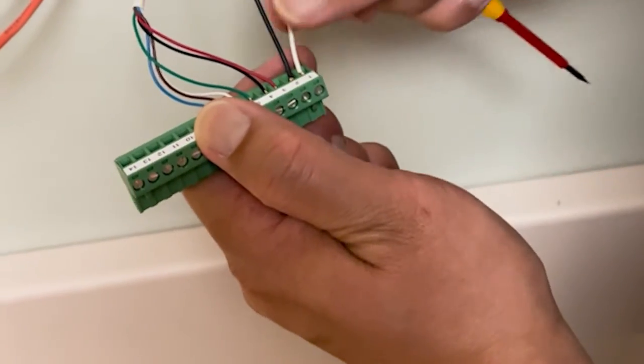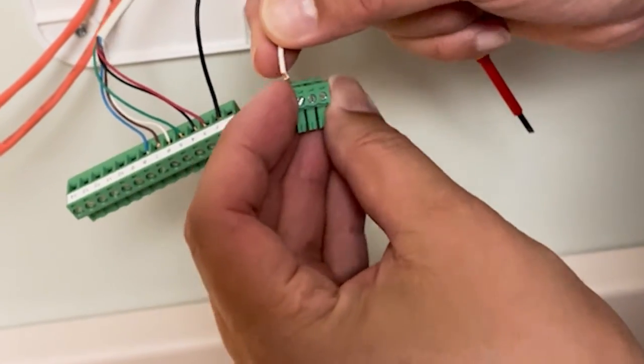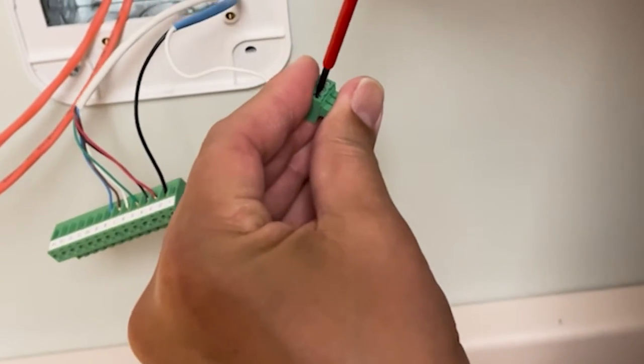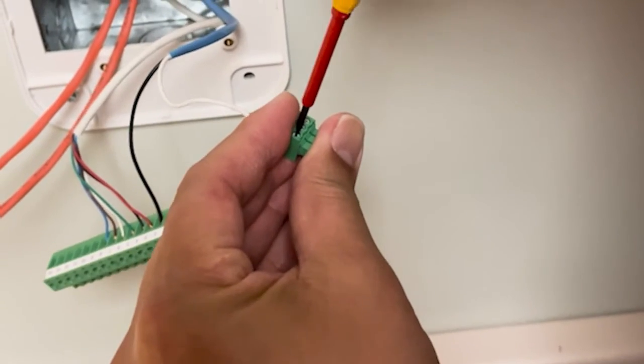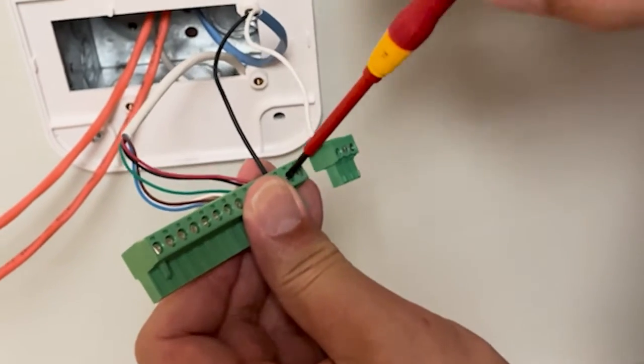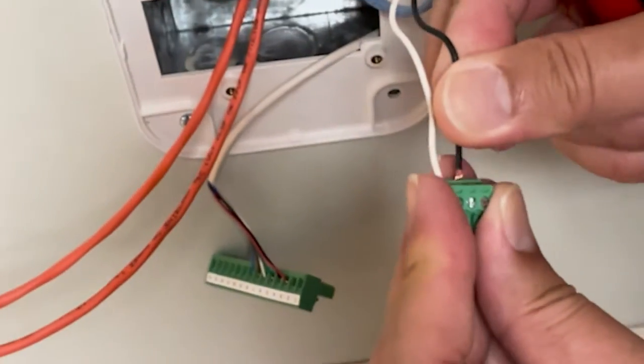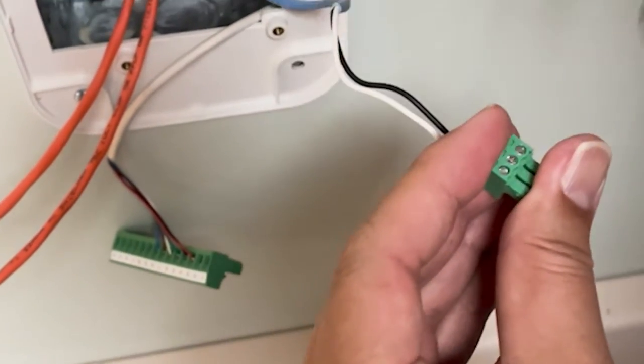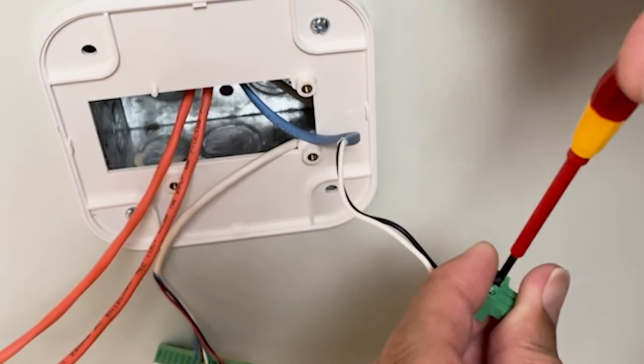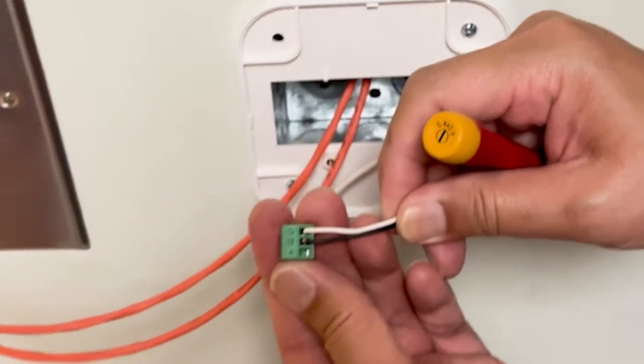Now we're going to add our power connector. We're going to remove the wires from the original connector and put those into ours. The wiring colors are dependent upon how you're connected to your transformer in the ceiling or wherever it is located. In this case white was the 24 volt and the black is the common. Now we've got our power done.